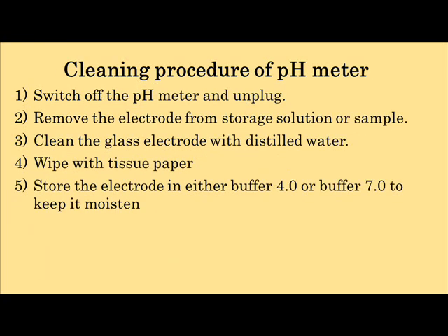Cleaning of the pH meter is an important part because we check a variety of samples on the same pH meter, which may lead to deposition of particles on the electrode. The pH electrode may carry traces of material to the next sample if not cleaned properly. It is delicate work to clean the electrode, so do it as per the following instructions.